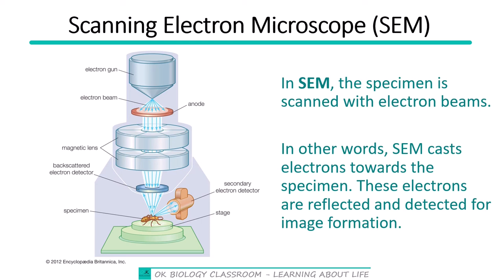But one may ask, so why do we need the electron microscope if we have the light microscope? Yes, the point is that there are so many organisms or specimens that we cannot study with the light microscope, because the light microscope is limited in its magnification. It magnifies to highest a few thousands, but this one can magnify millions of times the size of the specimen. So that makes the electron microscope very, very important.